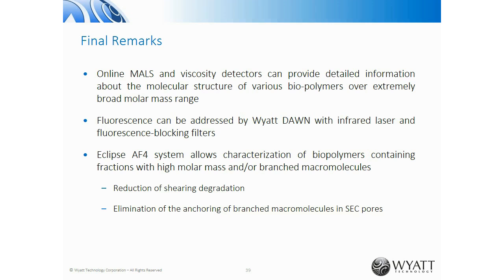Asymmetric flow field flow fractionation, which is also available from Wyatt Technology, was shown as an alternative separation technique that finds utilization mainly for biopolymers containing fractions with very high molar mass and especially branched macromolecules.